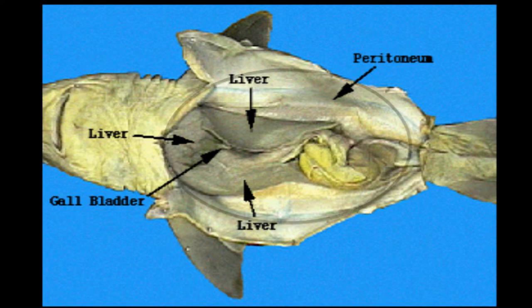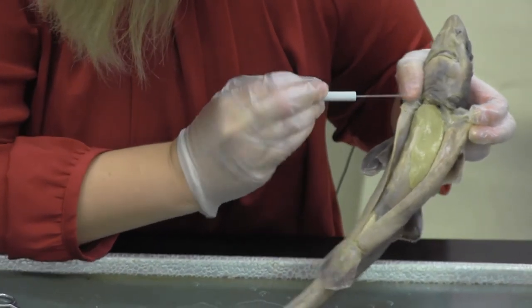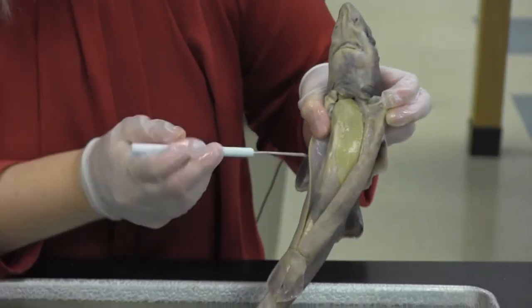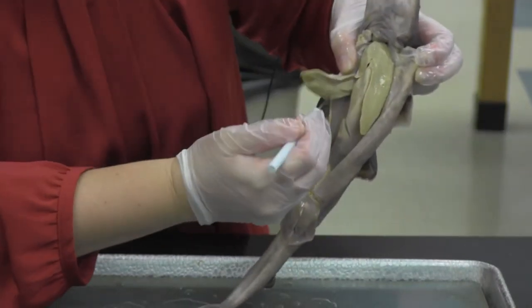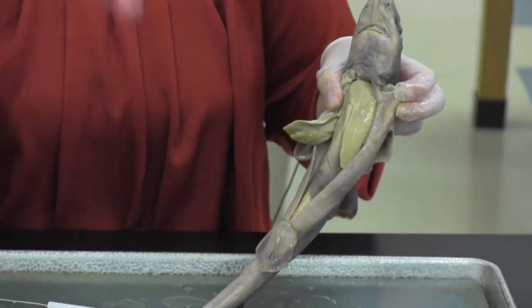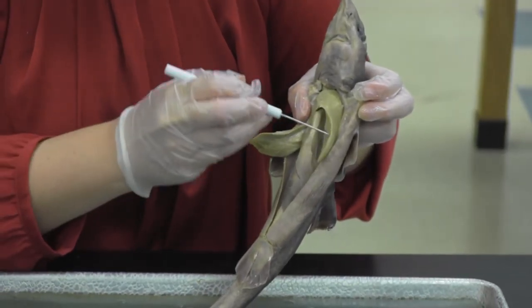I accidentally cut into her internal organs just a little bit, but that's okay. Up underneath here, you can actually see a little knob — that is going to be her heart, which is characteristic of cartilaginous fish. You're going to see these yellow lobes right here — this is actually going to be her liver. What these sharks do, which is very unique, is the liver produces oil. And since oil floats when you mix it with water, this actually makes the shark more buoyant.